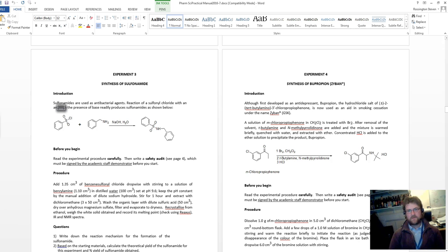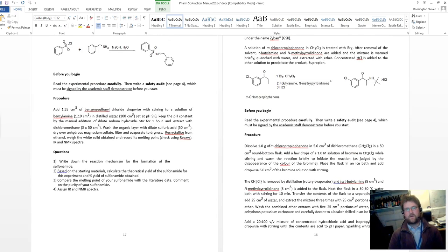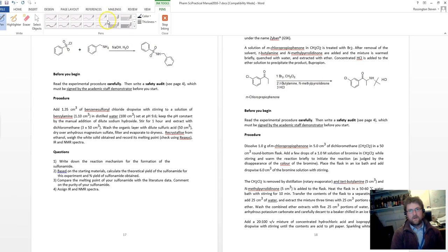Just some comments about the practical nature of this work. I noted that a lot of students walking around the lab, and I did mention this to some of you, were not clamping your very delicate pH electrode into position. So once we had a flask, that is a flask by the way, on the hot plate stirrer, the flask then should be clamped into position.